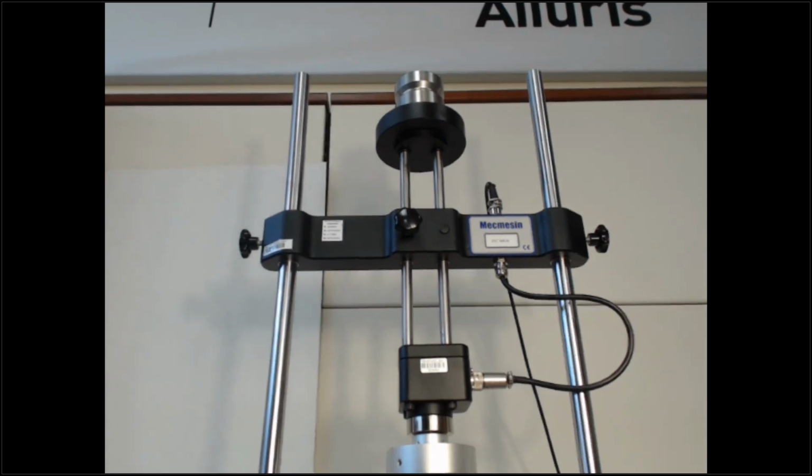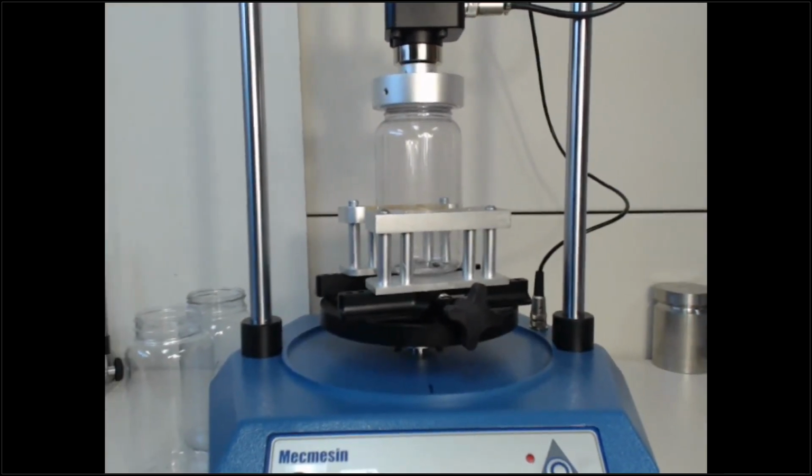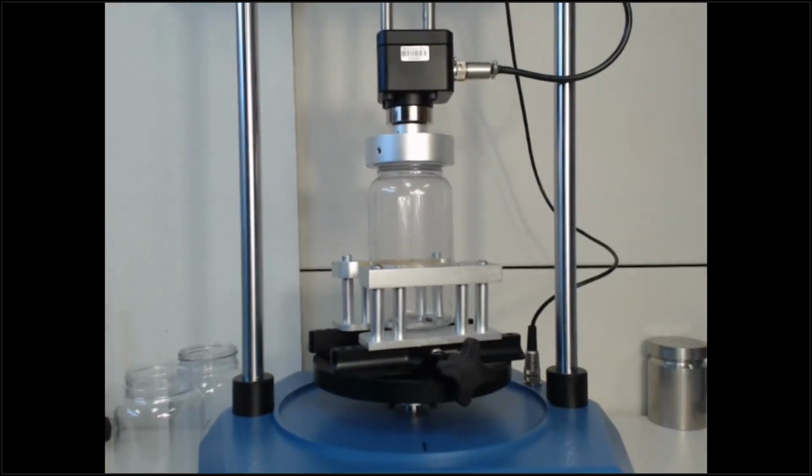And having set that standard, if we randomly picked a handful of samples and put them in the tester and ran the test, and we found out that they're not opening, then we could go back to the drawing board and determine where the problem is, whether the capper is applying too much application torque, or if there are any issues with the threads, or that the lock-in mechanism is faulty, whatever the case may be. But again, if you maintain a certain level of consistency in the components, when there are issues, you can retrace your steps to try to figure out what the problems are.